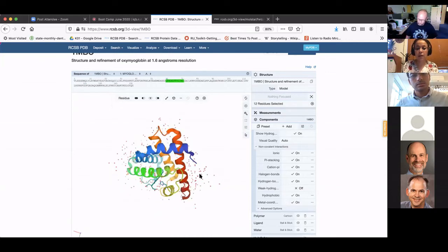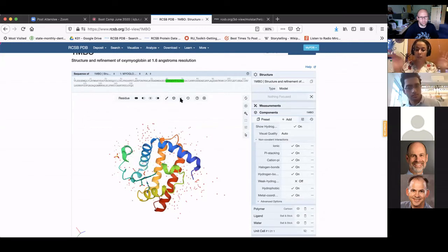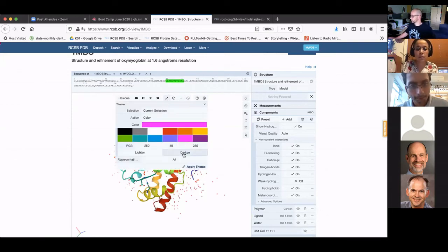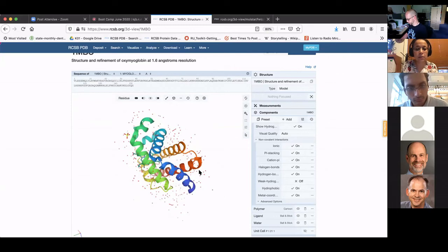Okay. Notice it got highlighted in this green color, both in the 3D canvas and in the sequence panel. This is the set that the software is now thinking about, and whatever instructions I give it, I can say hide it or make it go away, it's gone. I can undo that. I can also say color it magenta, because that is interesting. And it didn't do it. No, it did do it. Why didn't it do it?